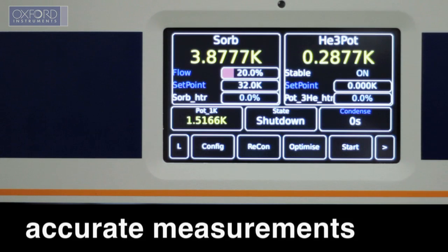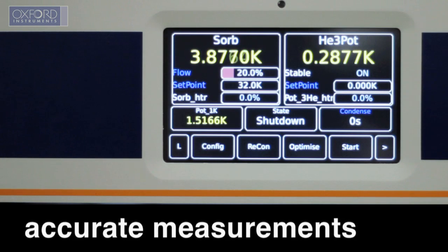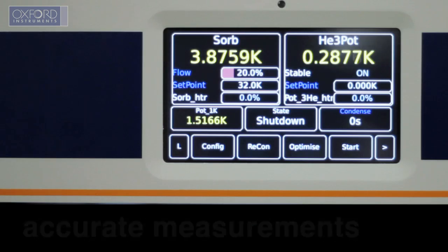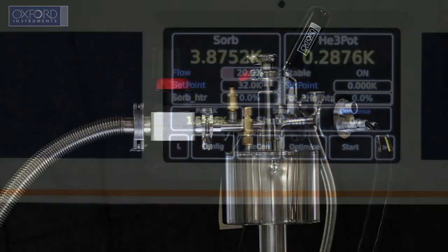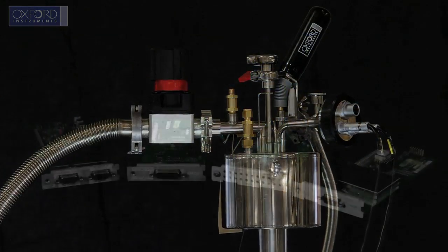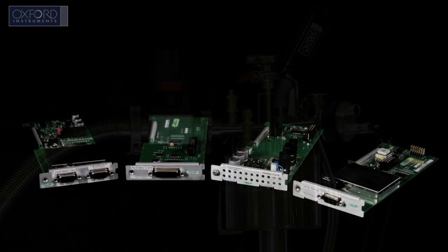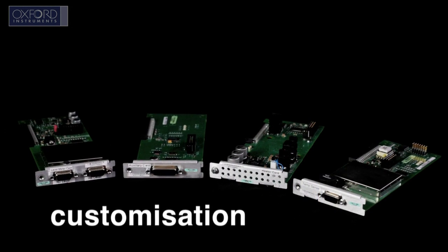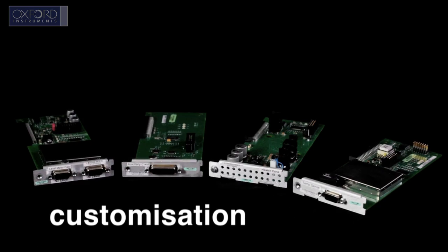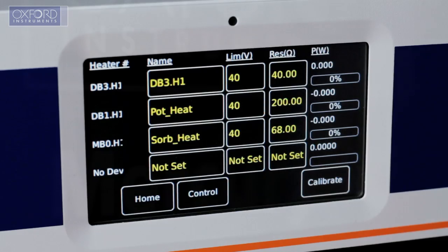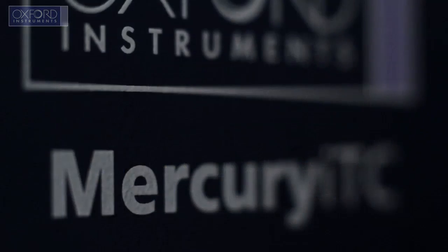We have seen that the Mercury ITC not only allows for accurate measurements, but is also extremely versatile. It can adapt to your needs via the addition of plug-and-play expansion cards and can be used to control up to four PID control loops.